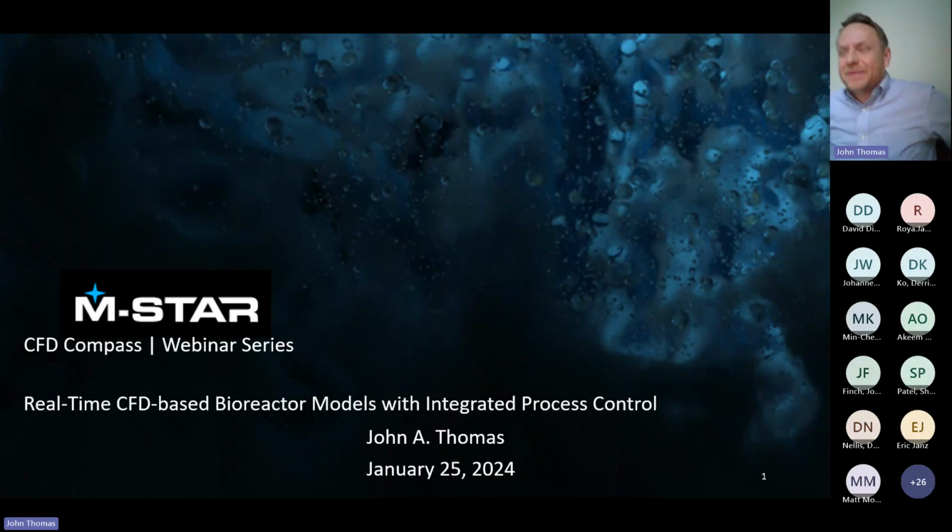We have a really interesting topic today, talking about real-time CFD-based bioreactor models with integrated process control. We'll be talking about CFD, some transport physics modeling. We're going to be talking about some controller theory. We're going to be talking about bio growth and cell growth kinetics and how we can incorporate those into these CFD models and whatnot. It's a pretty big tour.